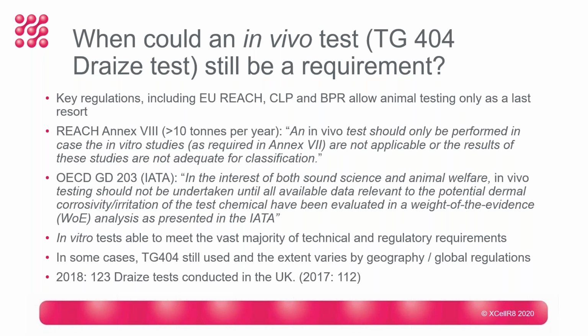So there could be a chance that the regulators might come back and consider that for some reason the data is not adequate and may insist on an animal study. The IATA states, and I think this is really powerful, in the interests of both sound science and animal welfare, in vivo testing shouldn't be undertaken until all available data relevant to the potential dermal corrosivity of the test chemical have been evaluated in a weight of evidence.